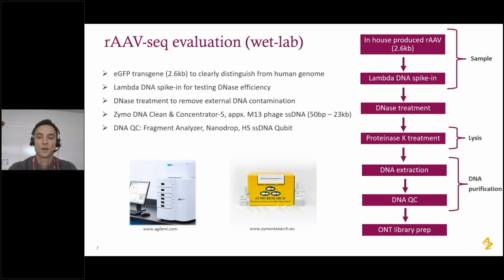For DNA extraction, we opted to use Zymo DNA Clean and Concentrator columns. We have a good experience with these columns, and they also have a little bit lower size exclusion point, so they can retain fragments longer than 50 base pairs.